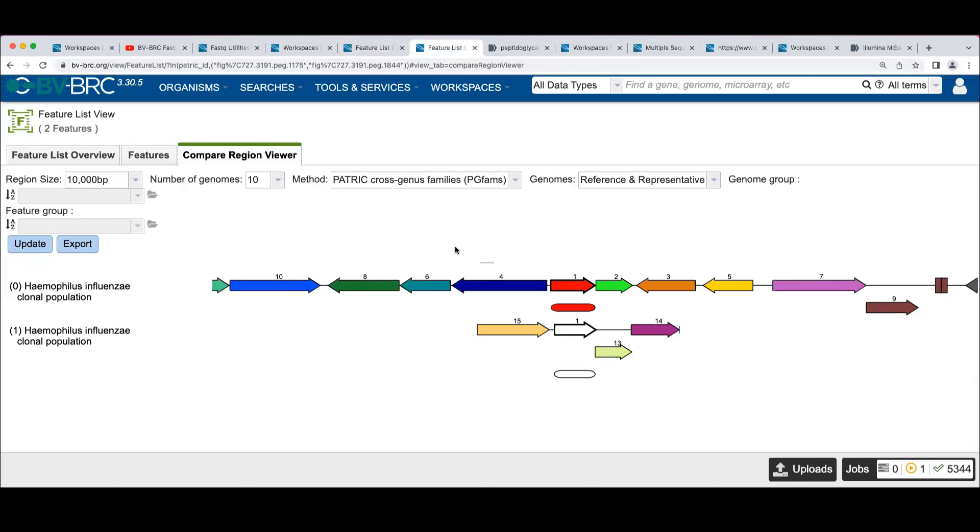What we're looking at in this view are the proteins in this genome. And so we're looking at two different regions in the same genome. Remember, that's where we started here.